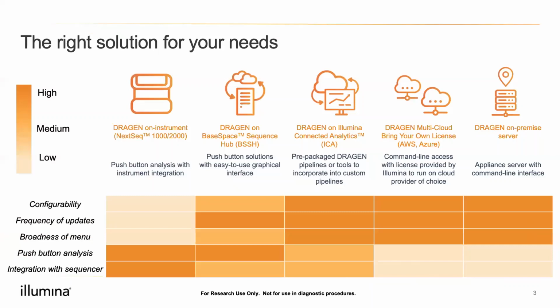You can access DRAGEN in a lot of different ways. So I quickly want to touch on this so that we can level set about what we're talking about for today's updates with DRAGEN version 4.0.